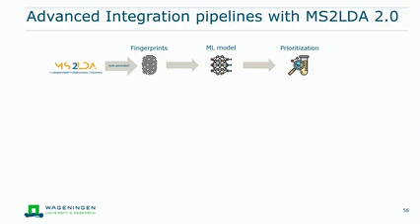For example, it could be you have 160 bits, so that's either 1 or 0. And if there's a benzene, then at one position it gets a 1. If there's not a benzene, then it gets a 0. That's a representation of structures in a computer-readable type, let's say. And we calculate fingerprints for the substructure. So we see where all the fingerprints from the structure recommendations overlap. And this is our suspected substructure fingerprint.